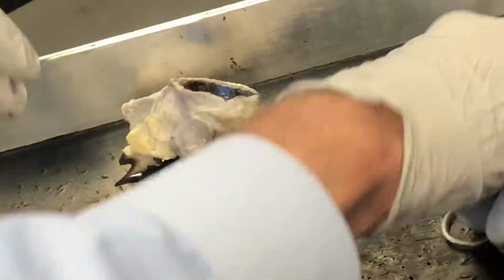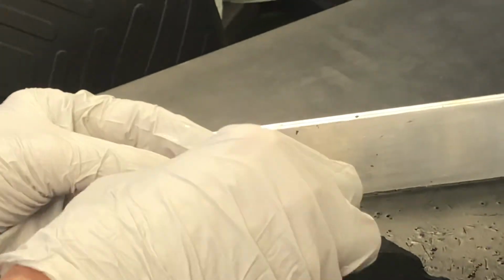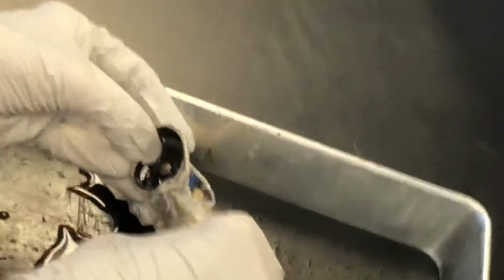There, we can see the lens. There is the lens right there. You take the lens out, yank it free. There we go. Remember the cornea.